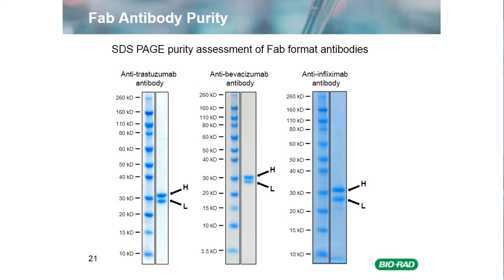So most suppliers will have a basic set of QC parameters that will be their default offering for most projects. And these will be the same for university projects, so they're often at quite a comprehensive but quite a basic level. But your suppliers will probably also be used to dealing with biopharma companies and IVD manufacturers for whom the antibodies that they supply are critical reagents, or critical raw materials in the case of IVD manufacturing. So they probably will be able to supply a higher level of supporting documentation and QC if you require it.